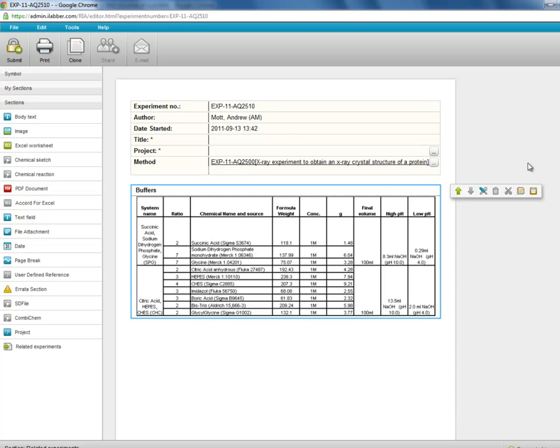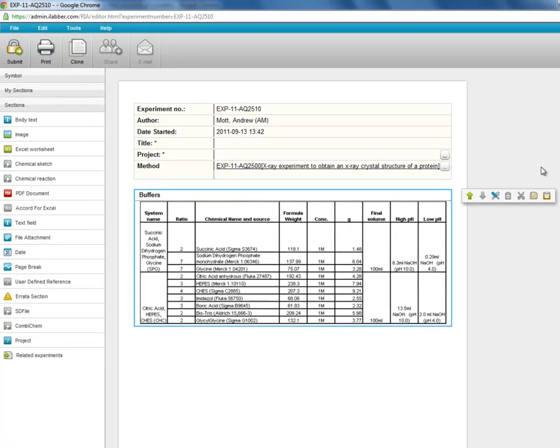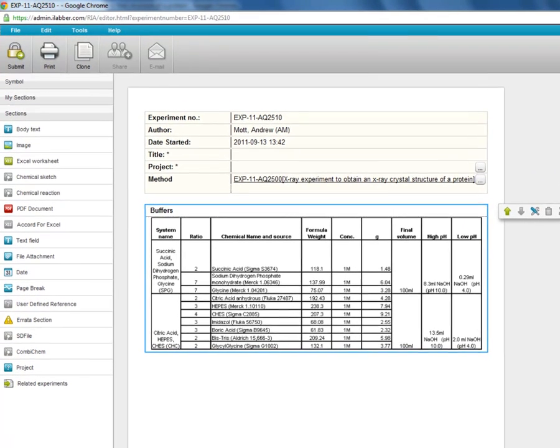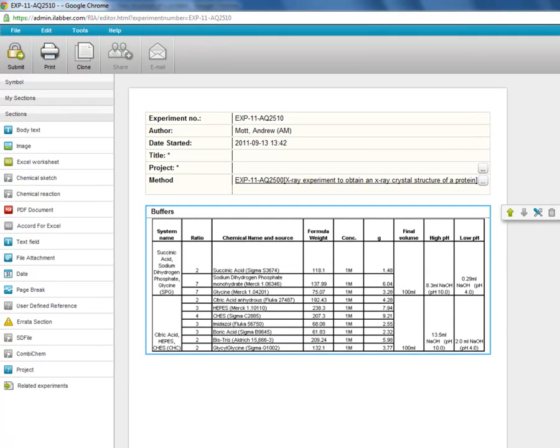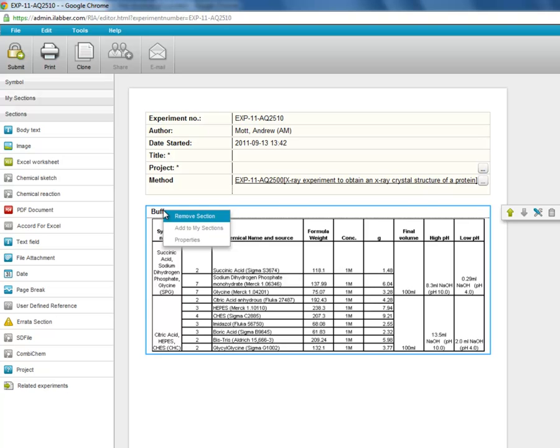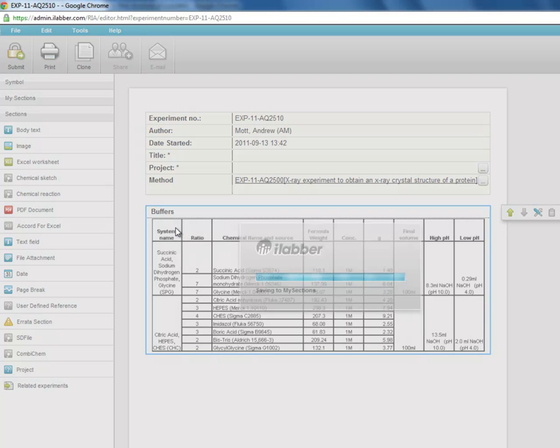So that is useful for copying sections once or twice. But if you have a section which you want to use several times, then you can store it in my sections. So for example we can take this section, it is highlighted with the blue around it. We right click on the title and go add to my sections.